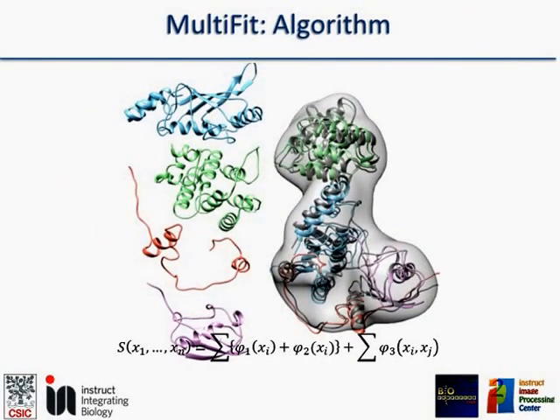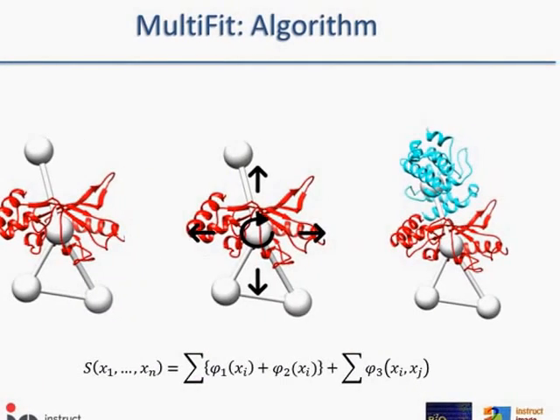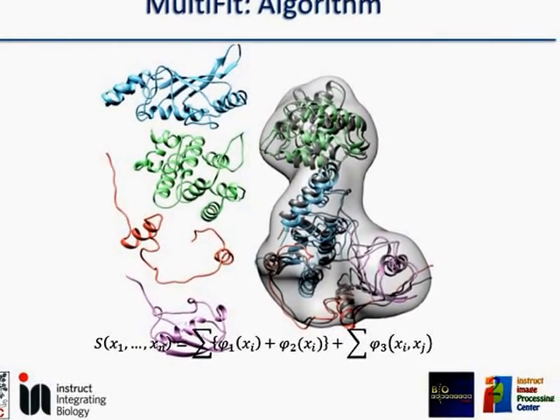So it's amazing to see how close to the native structure this fitting is, using a function that has nothing to do with molecular dynamics. Well, a bit disturbing, but yes, because in fact, after selecting the best conformation using this expression, multifit is performing a docking between the different subunits.